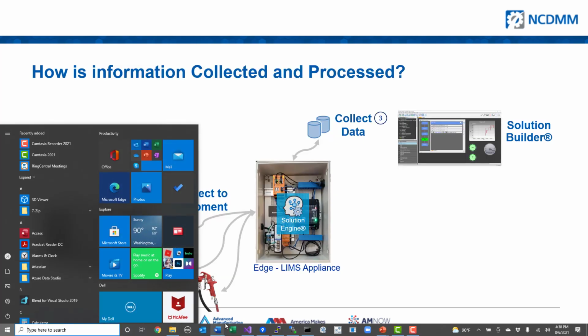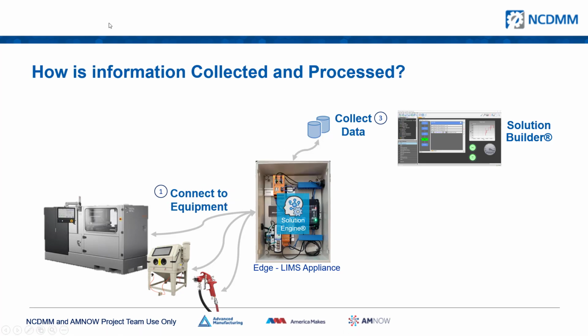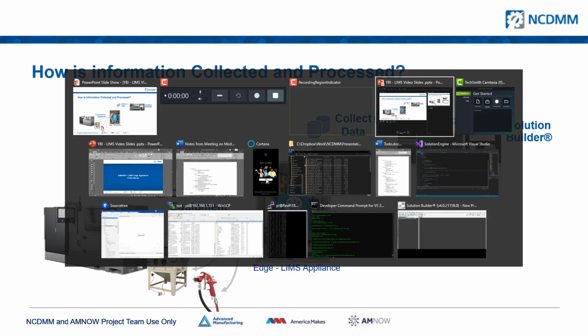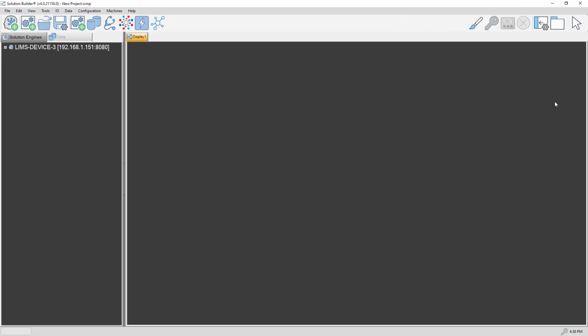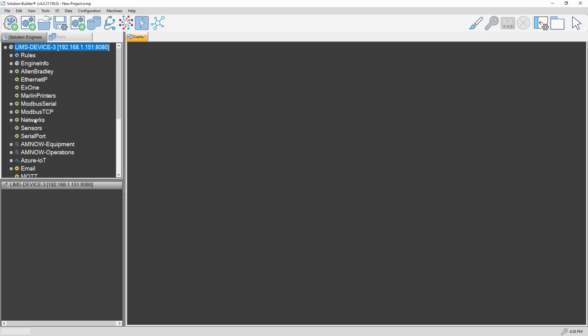So I'm going to go ahead and transfer over to a program called Solution Builder. This can go quite rapidly, so I want you to be able to see exactly what happens in Solution Builder and to understand what we're trying to do. Solution Builder is a PC-based application. As you connect to devices, and we've configured them and connected them, they appear in the tree over on the left-hand side. In this case, I've connected to a thermostat that was connected to a serial port.